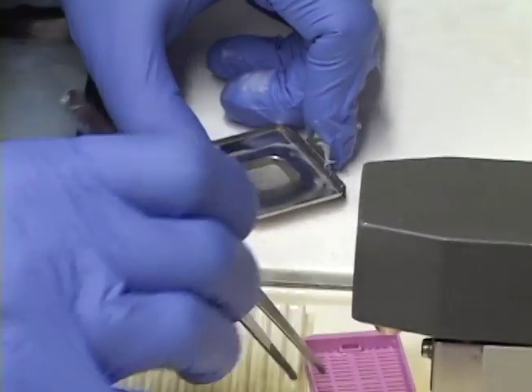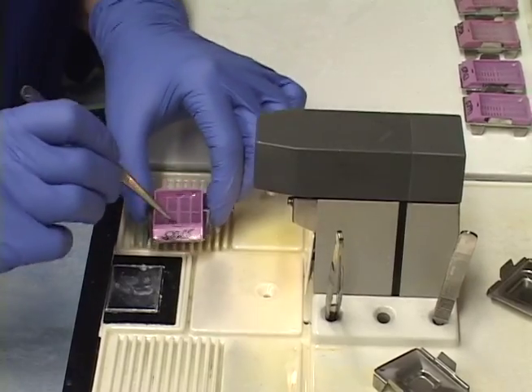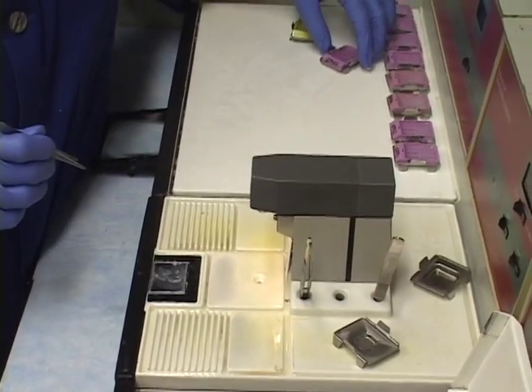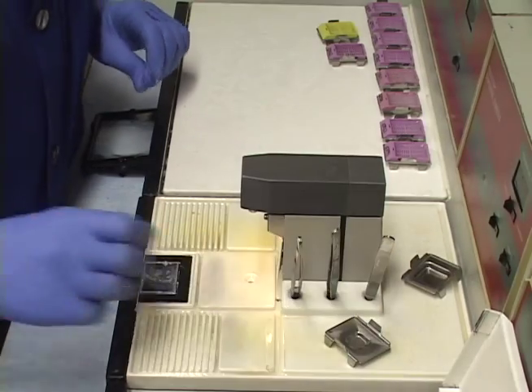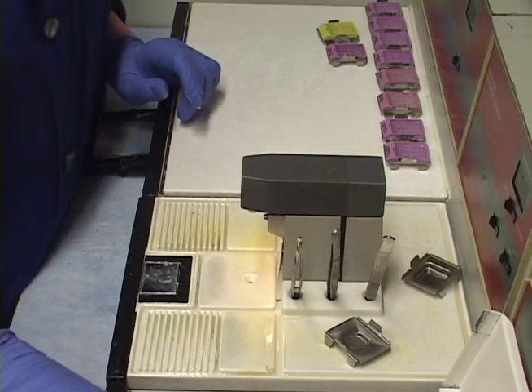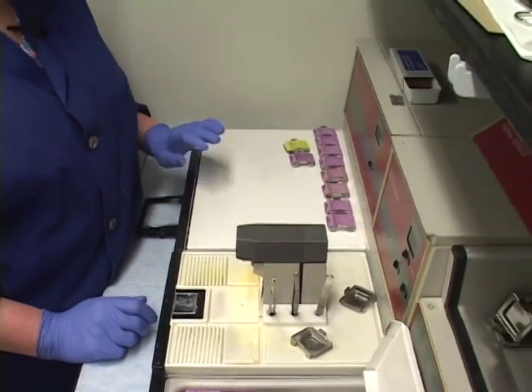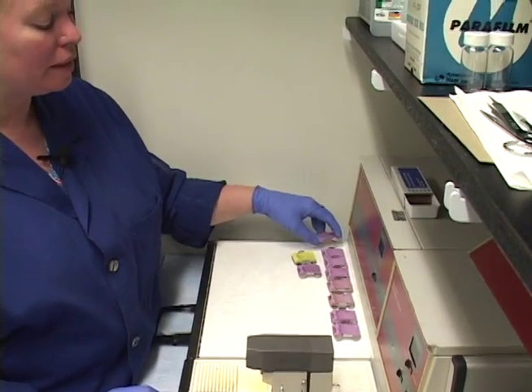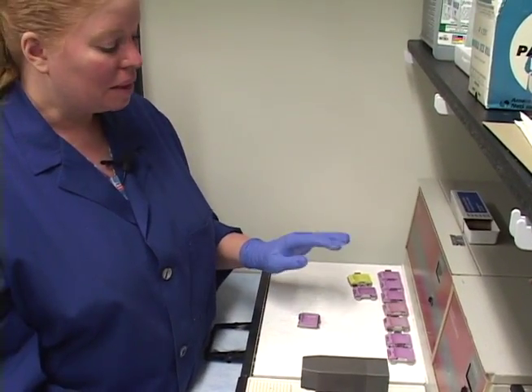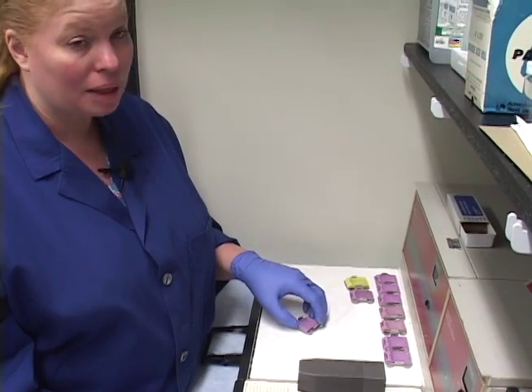I get the sample stuck, touch it down, get the lid on, and add a little paraffin. When this tissue is done chilling, you can sometimes hear crackling from the blocks — that means it's completely chilled and done. You should never have to force the tissue out. If you do, it's not fully chilled and you're likely to damage the block, possibly requiring re-embedding.